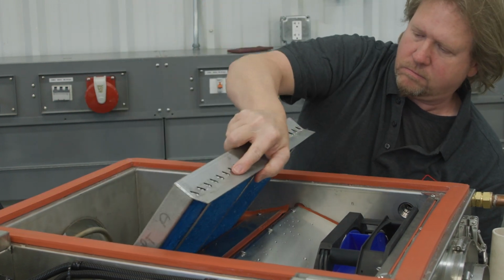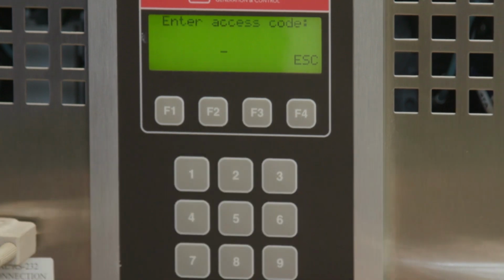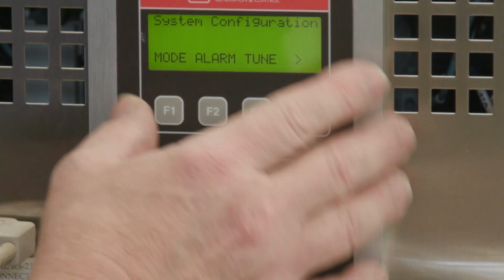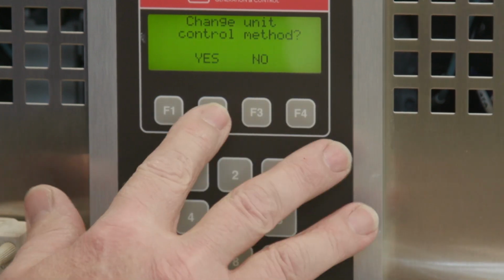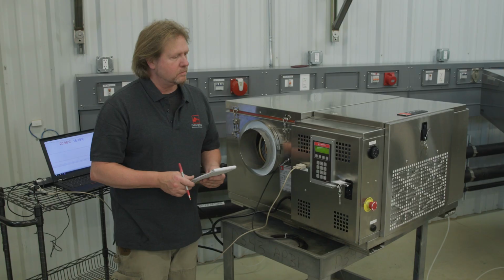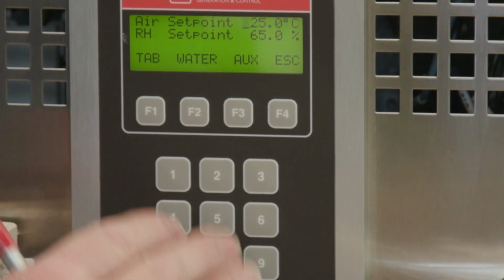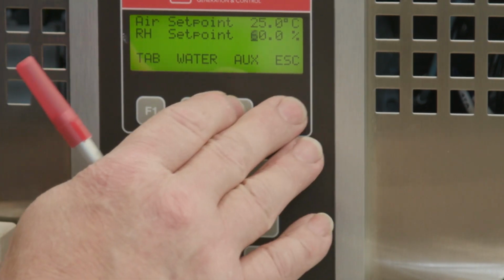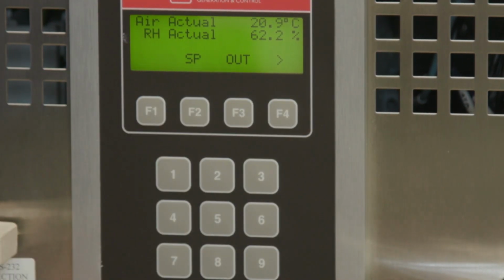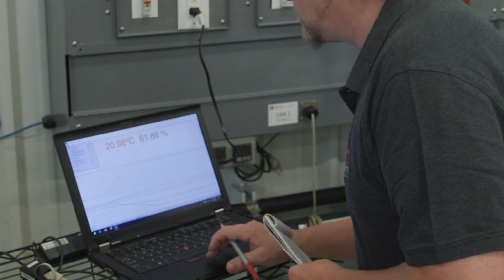Next, we will demonstrate an operational verification. Configure the SmartPad for the previous mode of operation. Configure the unit to operate at the customer's conditions. Continue logging with SmartLog and observe proper operation.